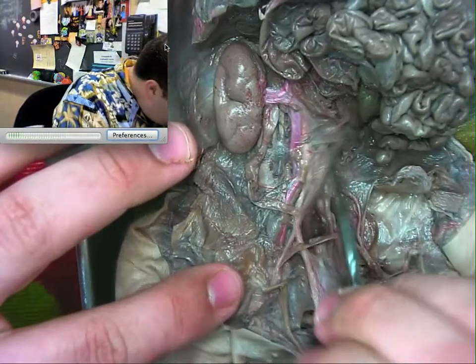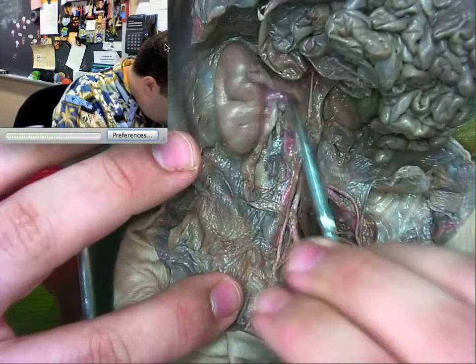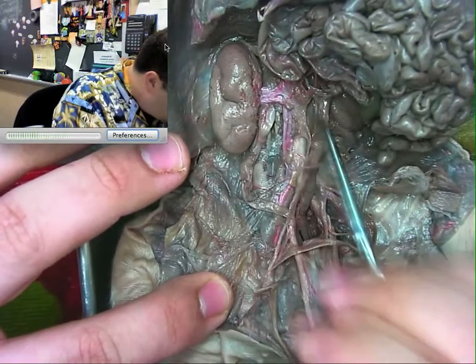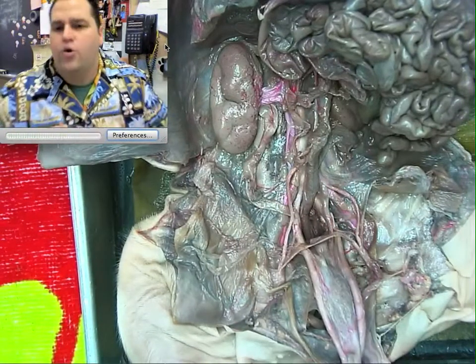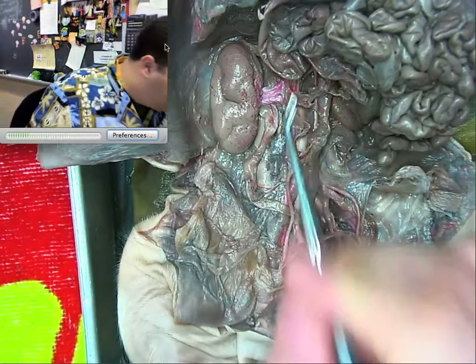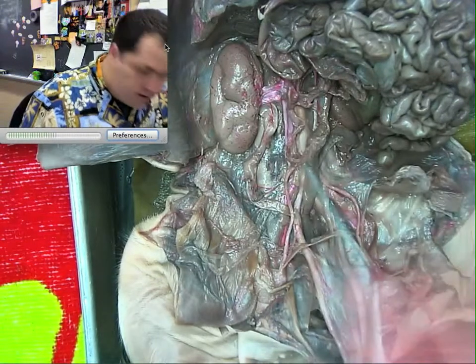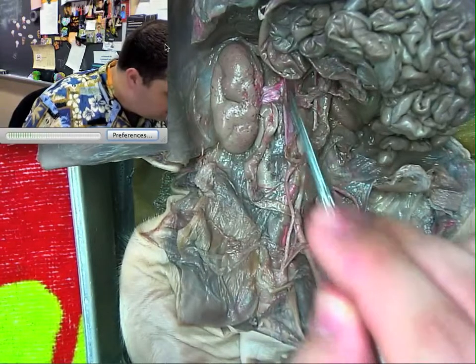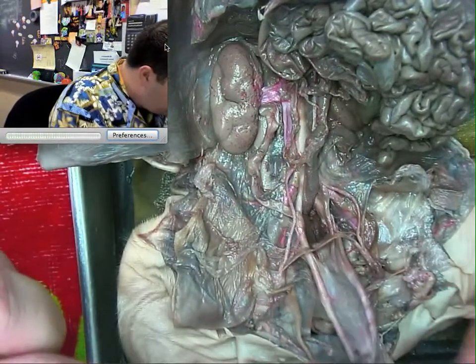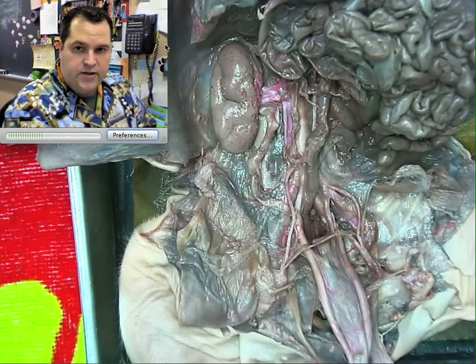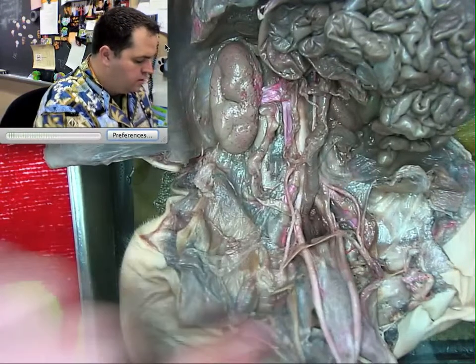If we were to dissect further, we'd find the aorta and note that the renal artery branches off it — that's where the blood is coming from. We know it's an artery coming to the kidney, and the flat vessel attaches to the vena cava. To review: kidney, renal vein to the inferior vena cava, renal artery, ureter to the bladder. These two large structures running parallel to the urinary bladder are the umbilical artery and the umbilical vein.